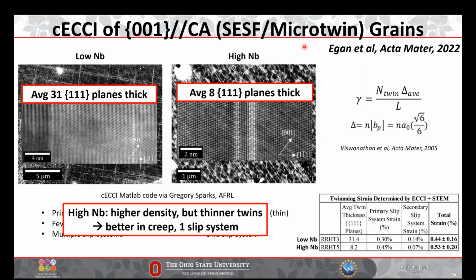So, it's a very simple, relatively straightforward technique in terms of getting the data that I acquired, right? I just take basically a quick EBSD scan and have Euler angles, but this can be very powerful information if you use it correctly. And that's sort of the takeaway from these first two cases, right? It's not anything too fancy, but it's very practical, and this is how we can use EBSD in our everyday research lives to make things easier and solve problems.